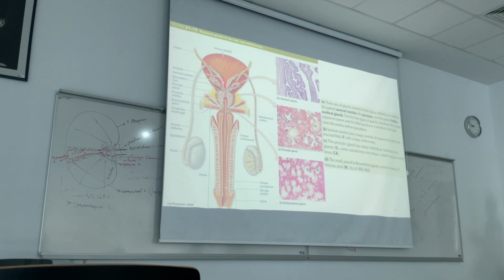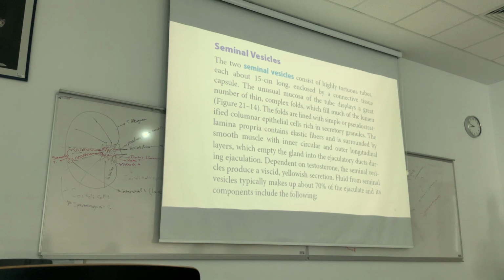Before the ductus deferens enters the prostate, you can see the seminal vesicle gland, and here we have the prostate gland. In this part, in the area of the membranous urethra, we have the bulbourethral glands. Bulbourethral glands have a shape similar to a mucous secreting gland. Here you can see this shape, a mucous secreting gland. But the vesicula seminalis and prostate have a little different structure.